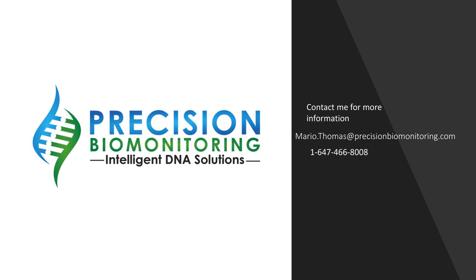So it's linked to the previous question. If you choose the right tools and the right normalization, you can say that if you see more sequences for mushroom one, it can be used as a proxy to say that in your samples you have more of mushroom one. But you have to be very careful about the 2x. It's not because you have 2x in your analysis that you have exactly 2x in your environment. So there is a bit of limitation for these approaches.